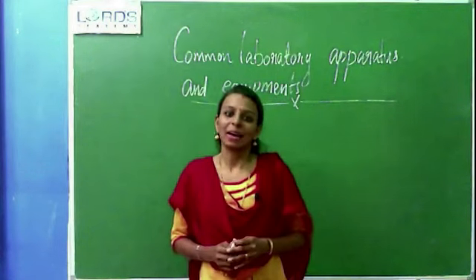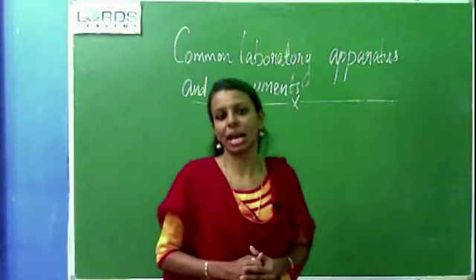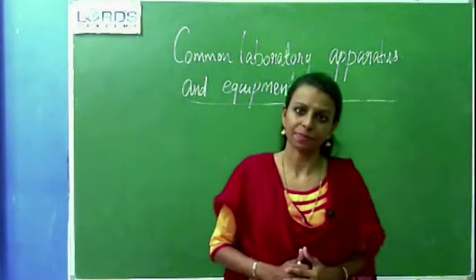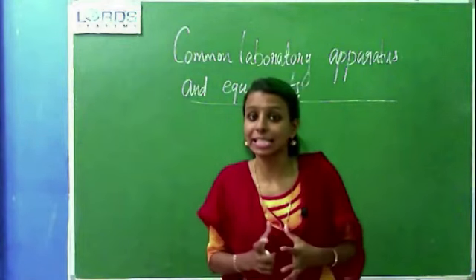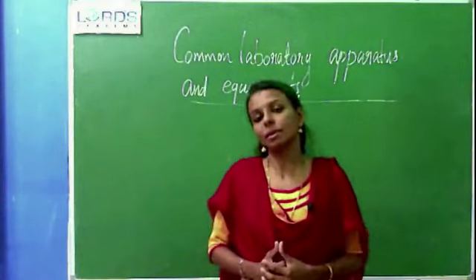Hi my dear students, welcome back to our chemistry class. Today we are discussing an interesting chapter, common laboratory apparatus and equipments. In this chapter we discuss the chemistry laboratory and the equipments which we are using in the laboratory.